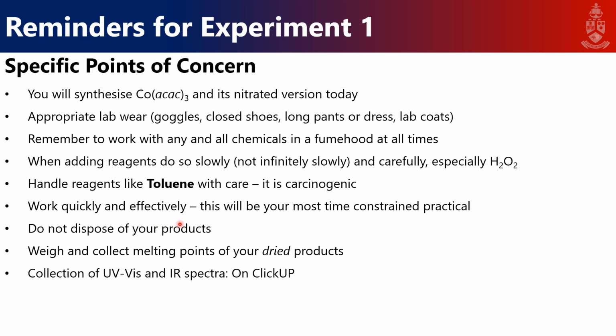You will need to work quickly and effectively for this experiment. This is by far your most time-constrained practical, so please ensure that you are prepared. You should not dispose of your products. They need to go in a polytop and you will receive marks for your products. That's a very important point, so don't flush your products down the drain.